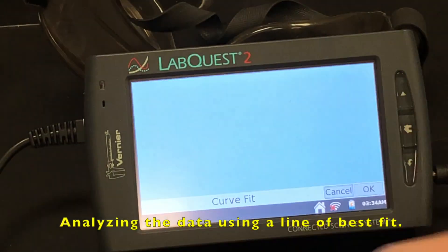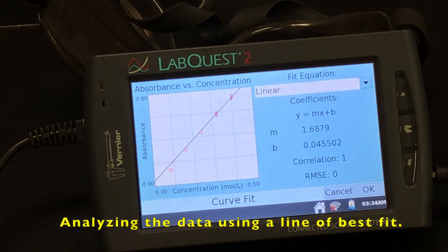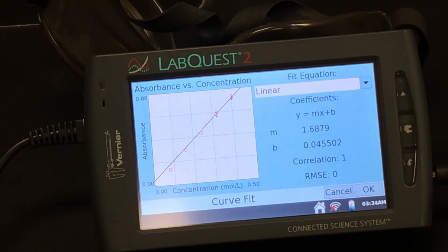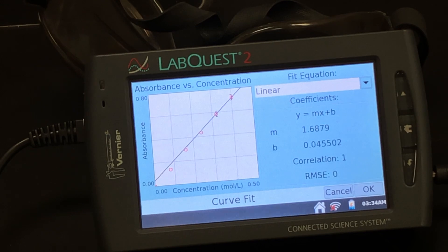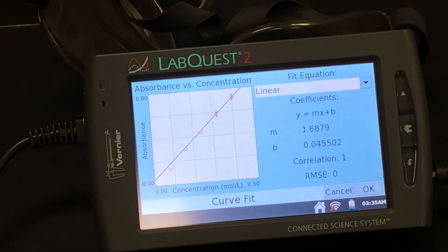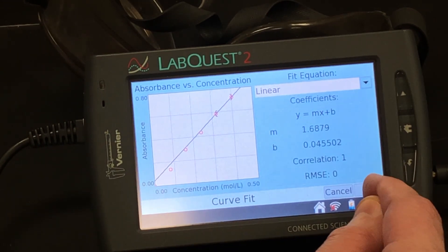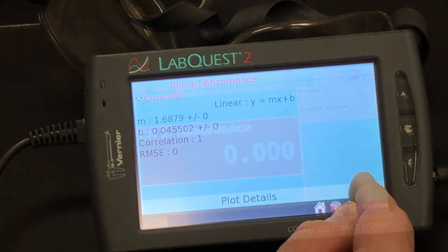Using the software that's inside the LabQuest, you generate a line of best fit. That line and the equation that results from it can be used to figure out the concentration of the unknown solution. You measure the absorbance, then you compare it to the line, and then plug it into the calculation to figure out the concentration, where the x value is the concentration, and the y value is your absorbance. Now the correlation factor of 1 means that it is a relatively perfect fit based on the data. Anything other than 1 means that the data set wouldn't work and that you would have to start over. That's how we're going to go about figuring out the concentration of the unknown solution.